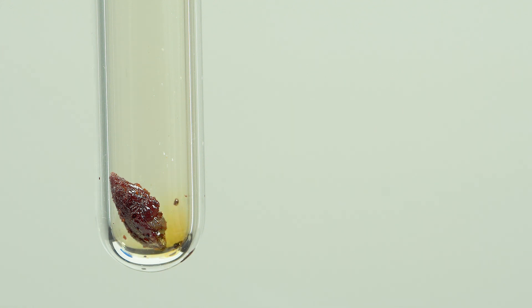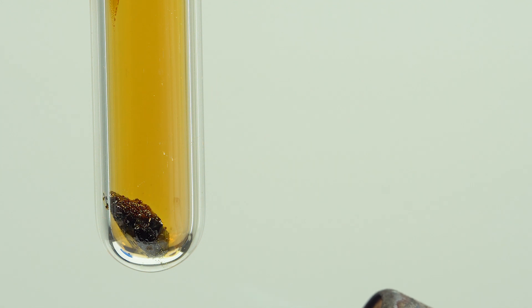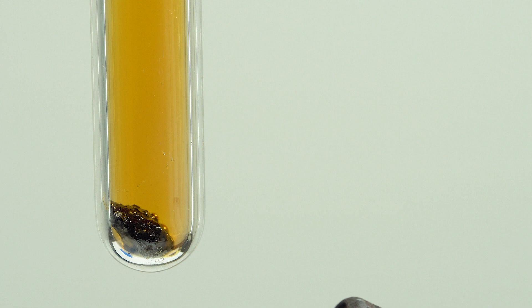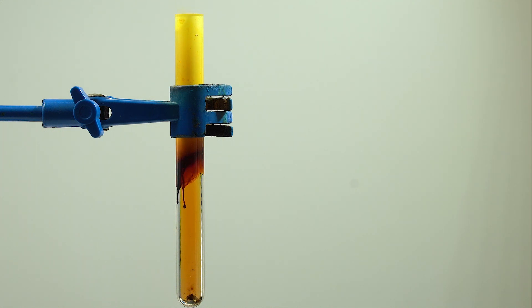At temperature above 60 degrees Celsius, iodine trichloride decomposes into chlorine and iodine monochloride, that's a red-brown liquid. Now you can observe iodine monochloride flowing to the bottom of the tube.